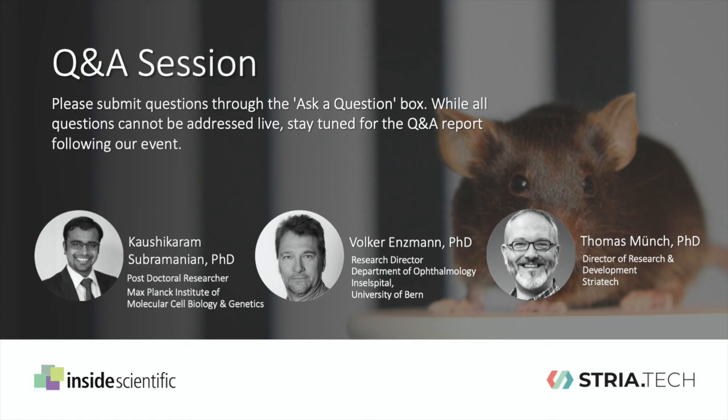Yes, this is possible. Maybe I give some background. If you would stimulate only the right eye with a moving stimulus, you would observe that the optomotor reflex is only triggered for stimulus motion towards the left, but not triggered for stimulus motion toward the right. The same but opposite would happen if you only stimulate the left eye.